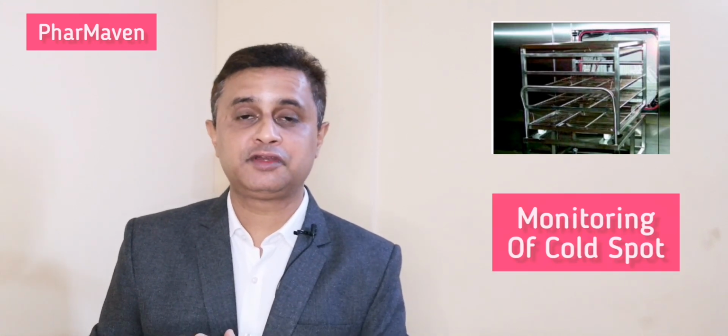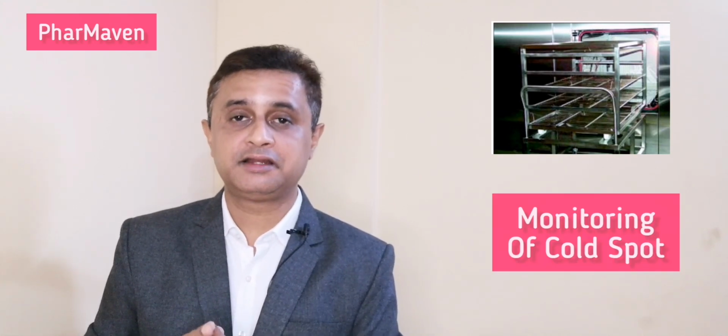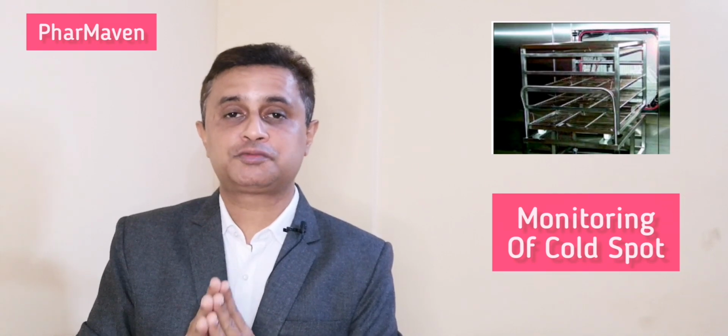The second question is, are you monitoring that cold spot during each requalification? Yes, it is mandatory. After you determine the cold spot in the empty chamber, you have to monitor that cold spot during the loaded chamber qualification also.